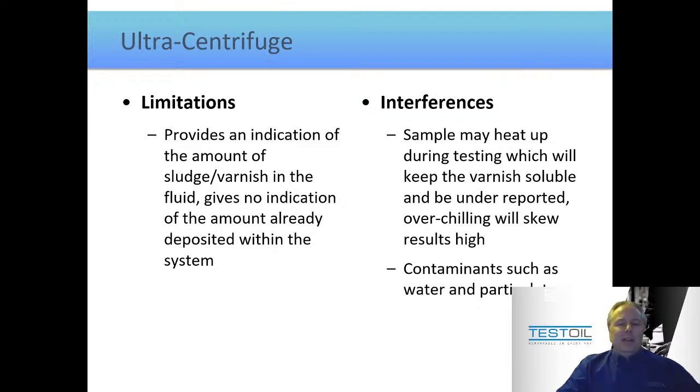But either way, one of the key things I like to point out when we go through all this testing is how to interpret the results. And when I go through the interpretation of results, I do mention what is the most common cause for these numbers to go up or down. And for MPC and UC, that's an easy answer. It's oxidation. And what prompts oxidation is generally, it's a degradation reaction with oxygen. So you do need some contact with oxygen, with an air supply. But what can accelerate it greatly is, of course, heat. But the other thing I like to mention when we talk about interpreting results is not just the most common cause, but what are the exceptions? What are the other things that people don't always think of?